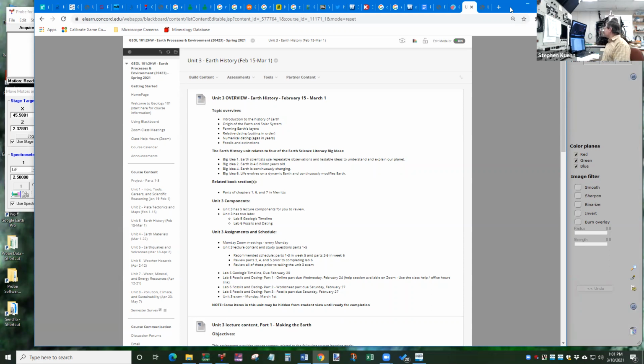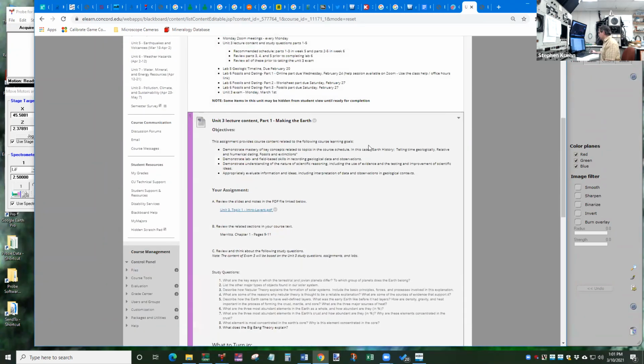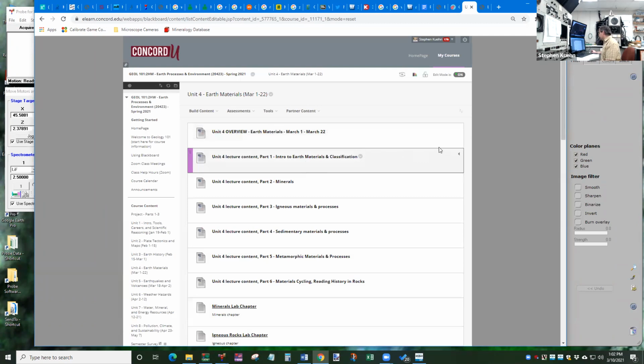All right, so you should be able to see the microprobe lab here, or part of it anyway. And I also have literally a box of rocks. So we need some samples. And so let me scroll down here on Blackboard. All right, so sorry, other unit. There we go.